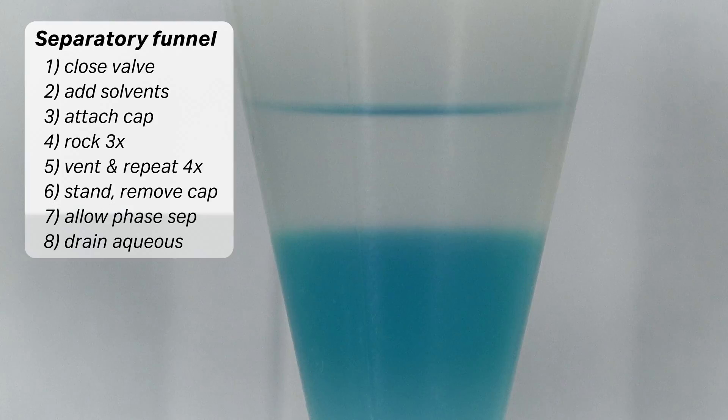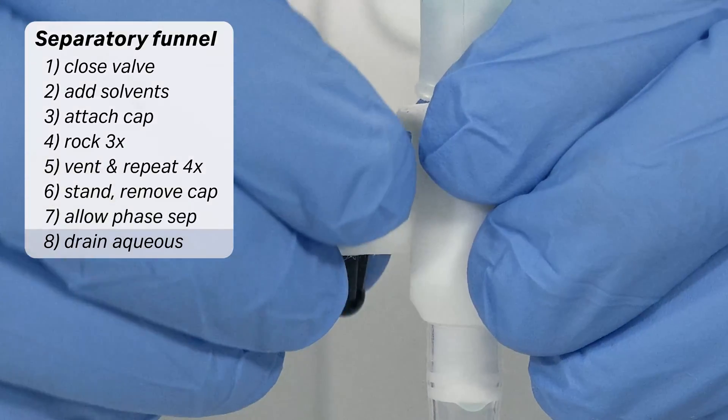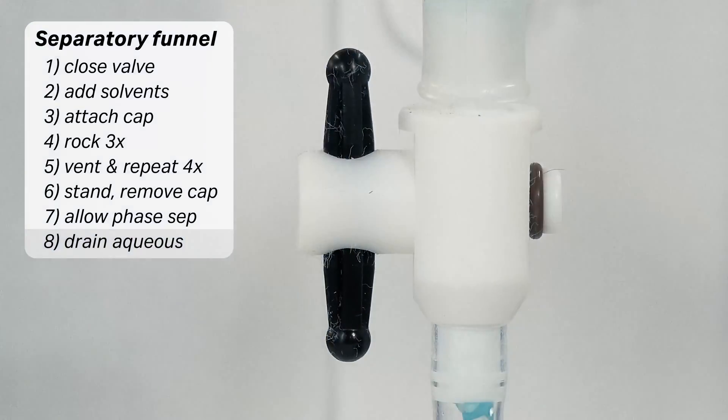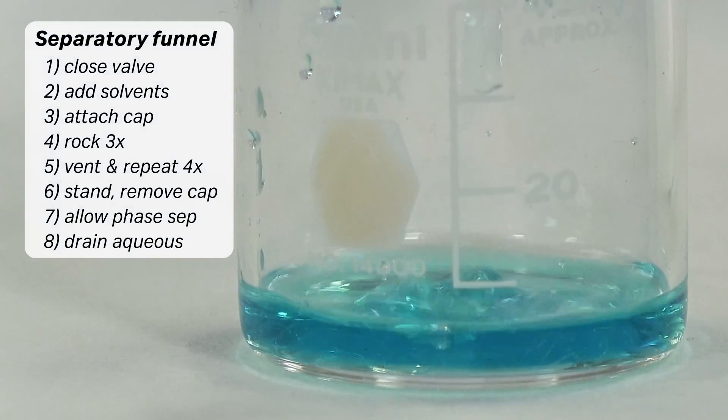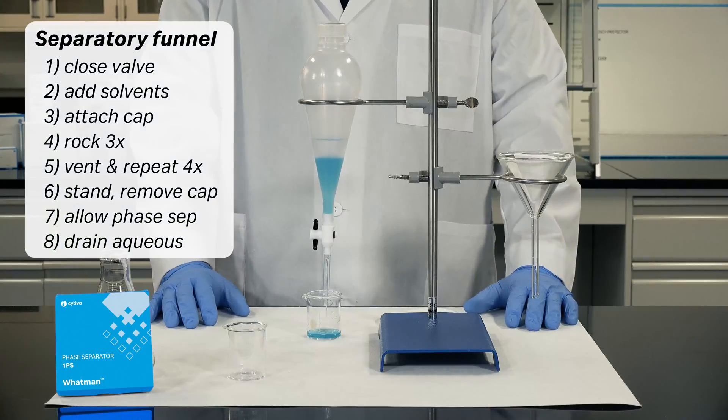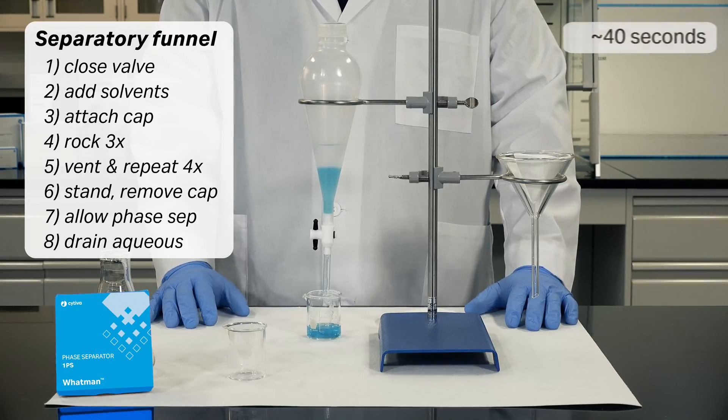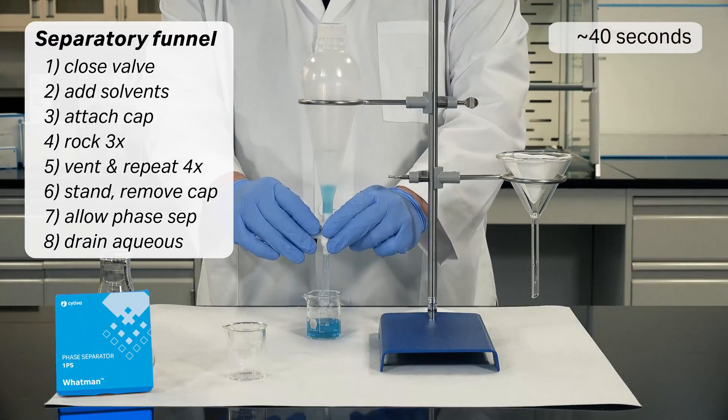Allow the phases to separate into two distinct layers. Open the separatory funnel valve and drain the aqueous phase into a beaker. Drain a small amount of the organic to prevent water contamination.